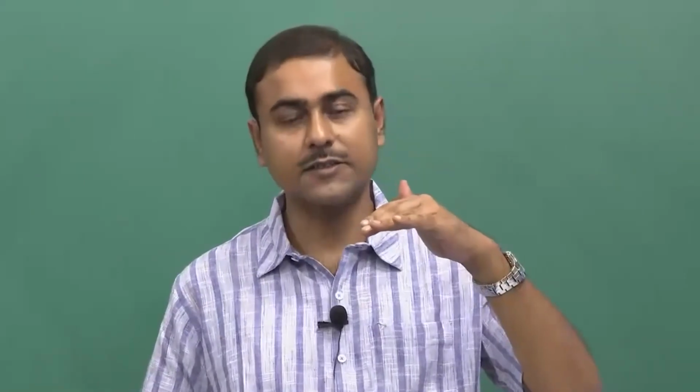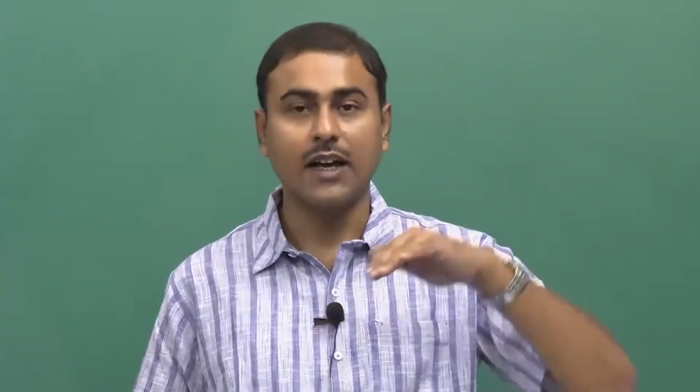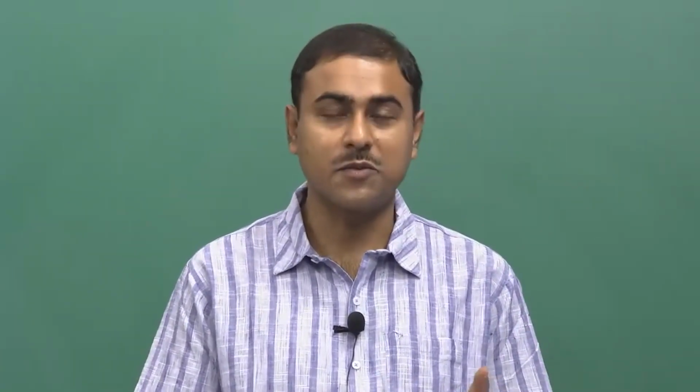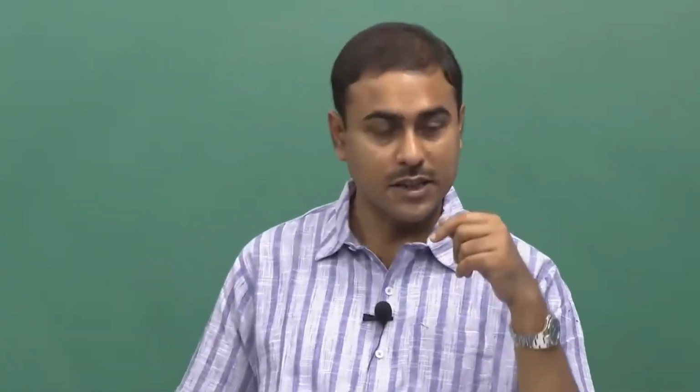So if SF is alone, then I see a moderate fluorescence intensity. When EQ comes and interacts with SF, the fluorescence will decrease, and that reaction will take its own time, and then when the reaction is over, it is forming S plus F, and the fluorescence intensity again will increase. If I do this several times, then I will get a clear idea about the rate of this enzymatic reaction. Here the plus point is that there is no dead time of mixing, because all the substances are present in the solution beforehand. What you are doing is only monitoring the SF, and EQ is already present.